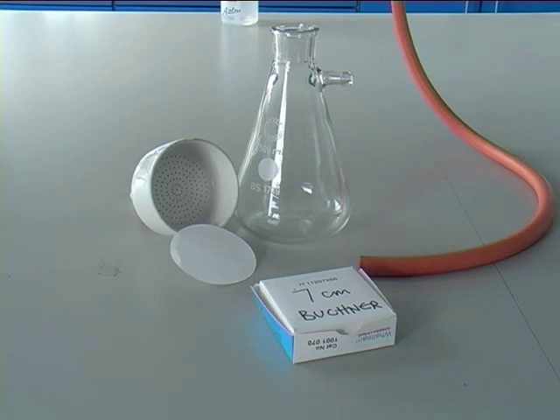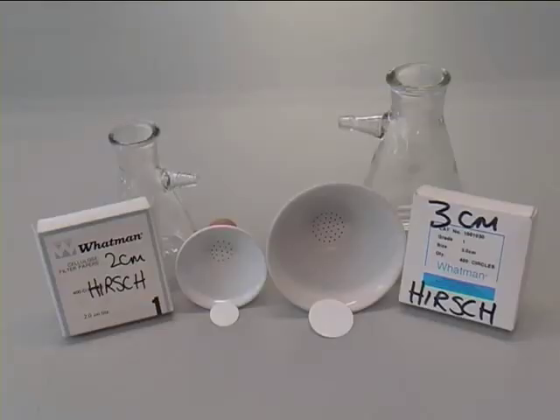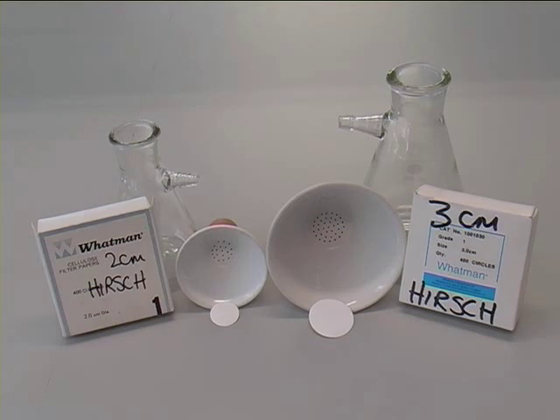Here is the equipment you will be using for a Buckner filtration. Notice the Buckner flask with the sidearm and the Buckner head, which is the round porcelain head. There are several types of heads for a Buckner flask. Here are two Hirsch flasks — the 2cm ones are for smaller quantities of material, and the 3cm Hirsch flasks are for larger quantities of material.